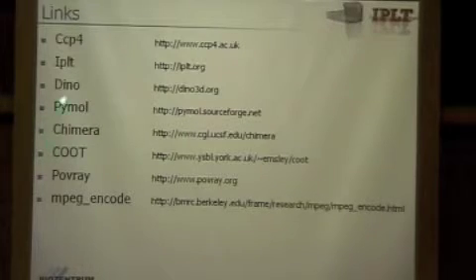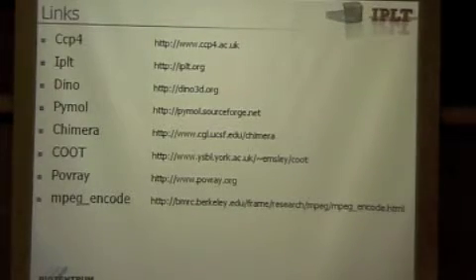I'm not sure if you can also do this with the other 3. I mainly use Dino because Oscar wrote it, and so if I have a question, I can just turn and ask him. And also, I hit you if you use something else. Yeah, that's also true. He doesn't like it if you use something else. So we just use it if he's not there, basically.